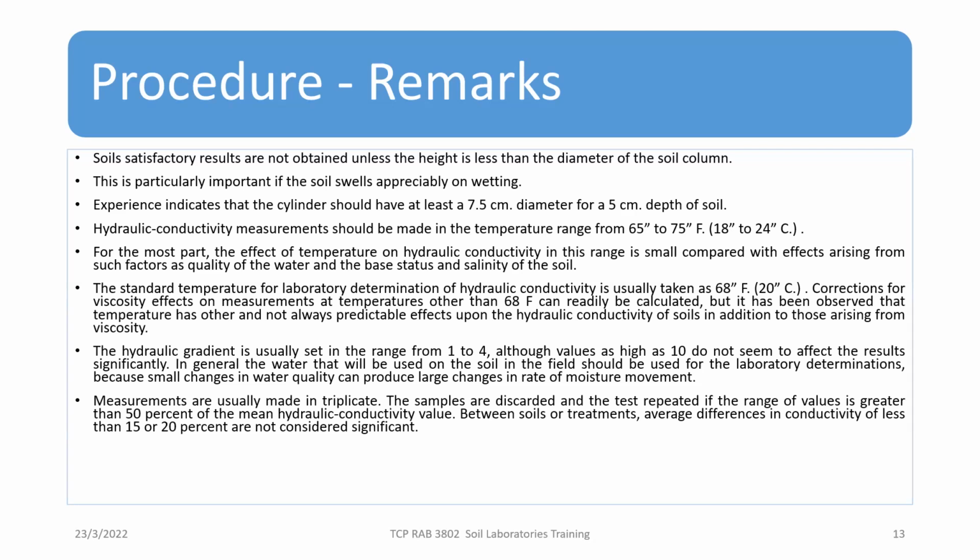Here, people always ask about water quality. In this test, to have a reliable measurement, it is recommended to use the water that is used in the field, not distilled water or deionized water. To maintain a realistic measurement of soil hydraulic conductivity, it is advisable to use the ordinary water that is used in the field or on the farm.